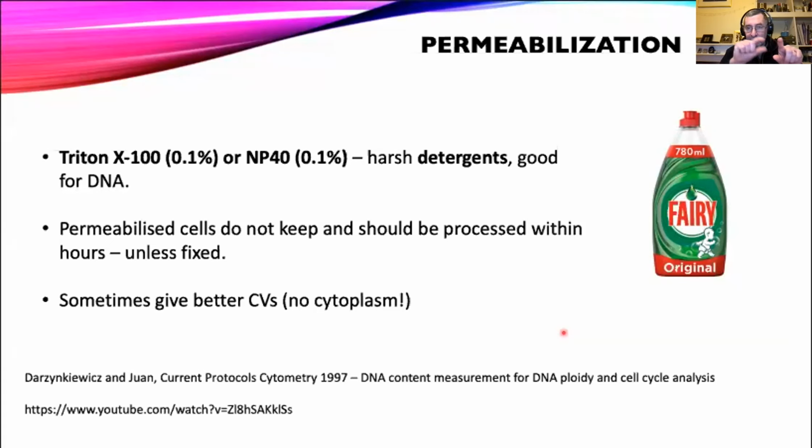If we manage to get that into solution by heating it or by treating it with sodium hydroxide, paraformaldehyde is polymerized formaldehyde, and what the heating does is it chops those bonds, and we end up with formaldehyde. And formaldehyde is what we fix in. Actually, I use a ready-made formaldehyde solution from Polysciences, although a lot of other companies do that as well, because getting paraformaldehyde in solution is quite a messy and prolonged business. It's a semantic thing maybe, but it's my hobby horse. You fix things in formaldehyde, not paraformaldehyde.